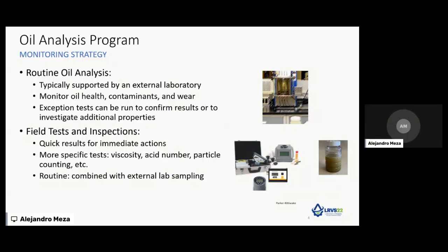But the purpose is monitoring the oil health, the contaminants, the wear, as I mentioned. And it's possible to run exception tests to confirm results or to investigate additional information. This is what we basically understand as used oil analysis. But let's see, we can do more.